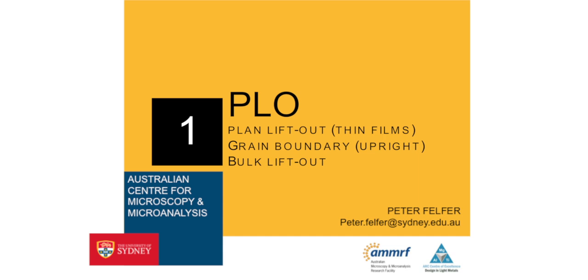And it would also be what you would do if you do bulk lift out, simply because it's the easiest thing to do. By bulk lift out, I mean anything that in the world of atom probe lift out is bulk, so any feature where the dimensions are more than a couple of microns in any direction, so that your entire lift out piece just consists of your region of interest.